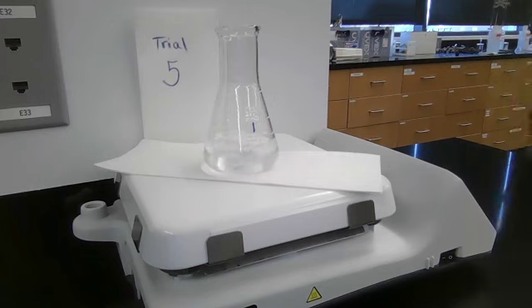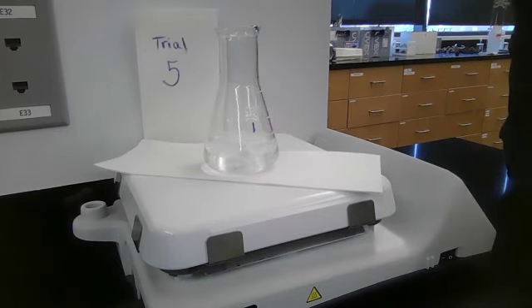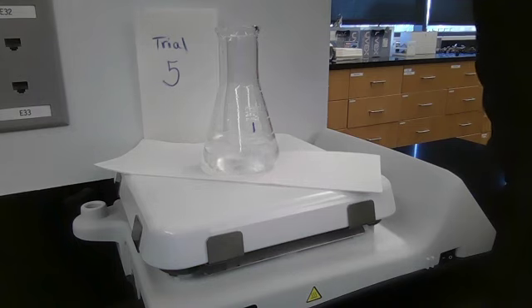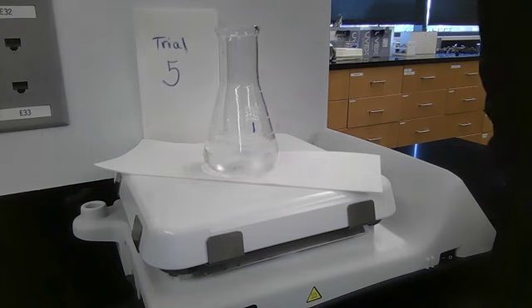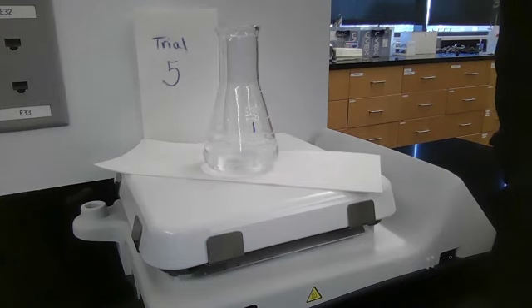So trial 5 is reacting. Iodine's being produced all this time, by the way. It's just reacting with the thiosulfate until that gets used up. And then it hits the starch. Cool. Violet to blue to then not so good looking brown.